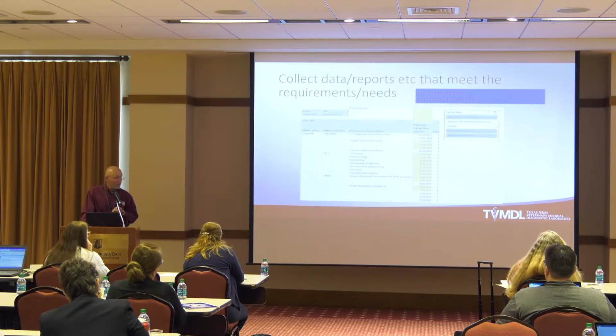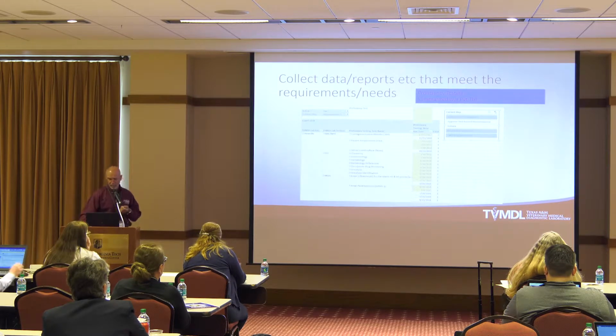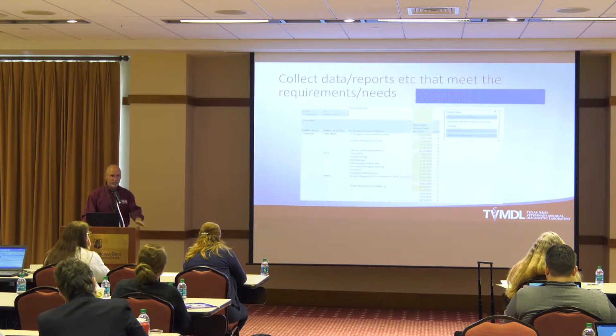Proficiency testing, summarized with the pivot table. So these are all the proficiency testings. This is an old report. So these are the dates that it was due, and we highlight anything that was past due at the time. This one actually has a slicer embedded in it, so you can select the different ones, because a lot of these reports will email out to the sections, to the individual users, so they can drill into this, and it's not just presented to the management, but actually down to the supervisors and section heads where they can look at this data too.